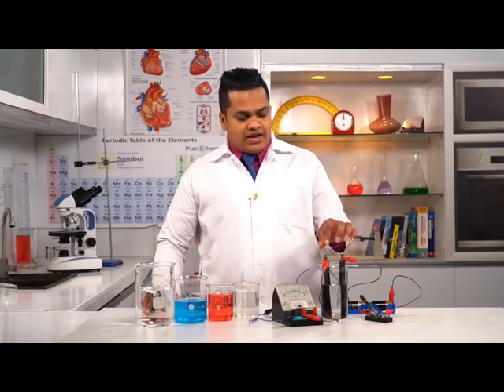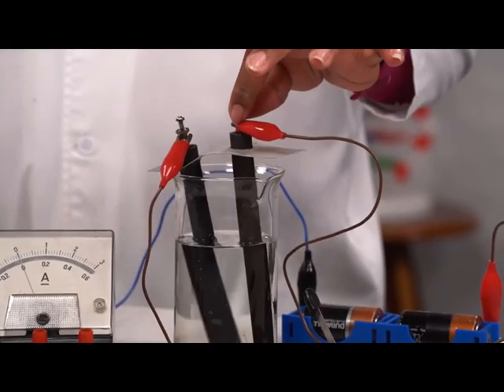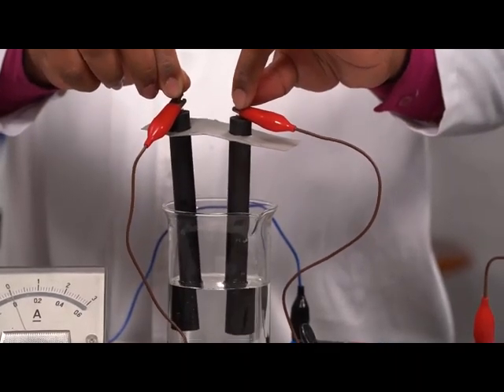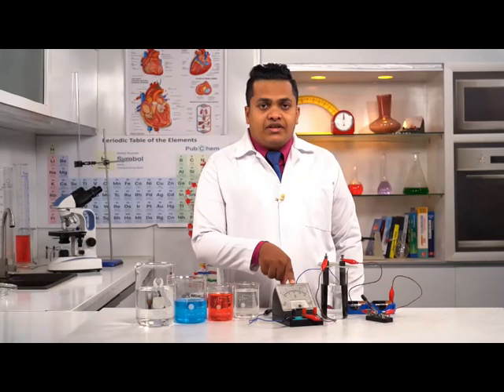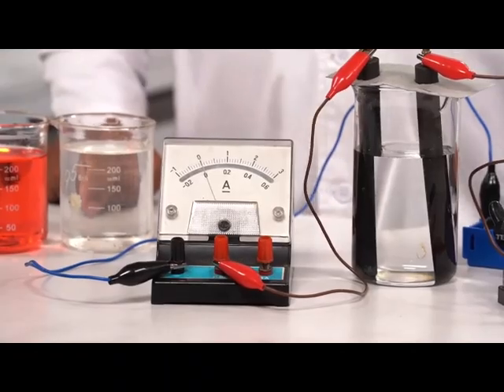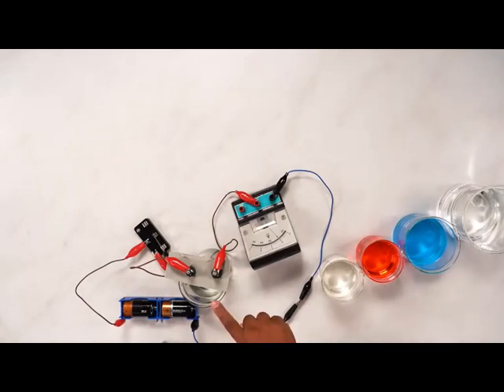So once again, I have prepared a small system that has two electrodes, right? These are carbon electrodes, which are dipped in the solution like this. To investigate whether there is a flow of current or not, I have an ammeter. Then this is the setup of two dry cells, and to connect and disconnect the circuit, here you can see there is a switch. So this is acidified water, my dear children.